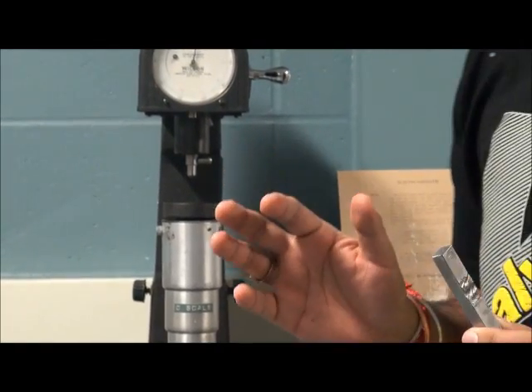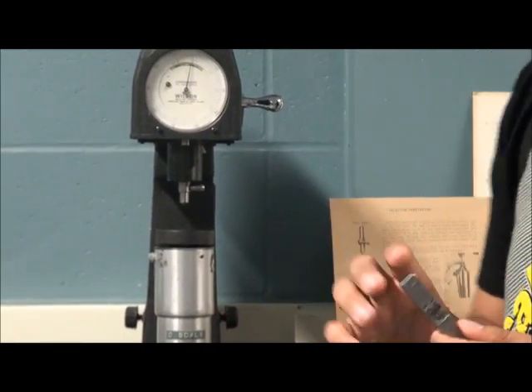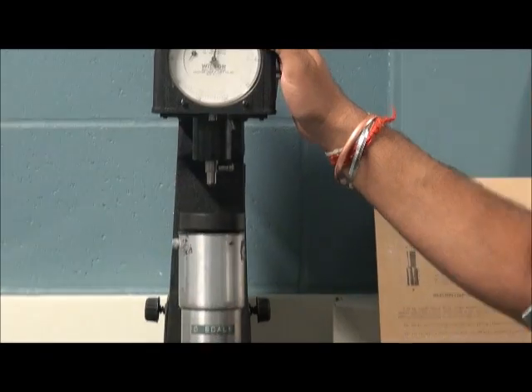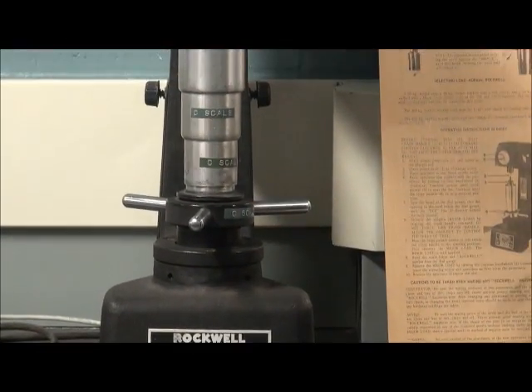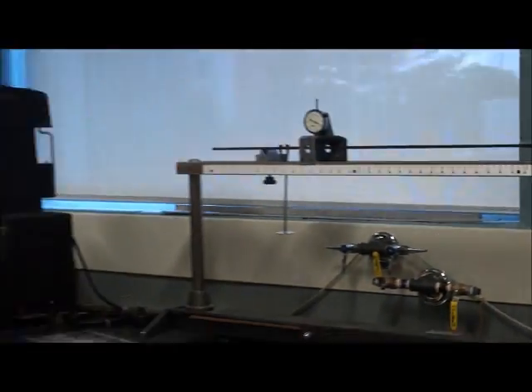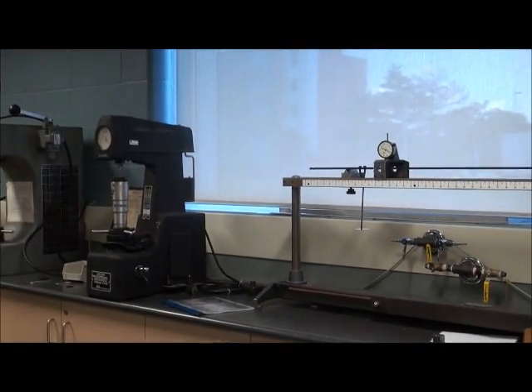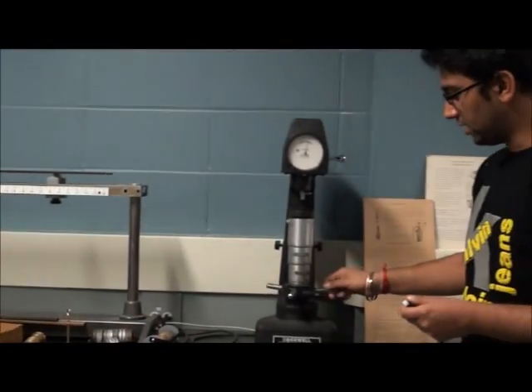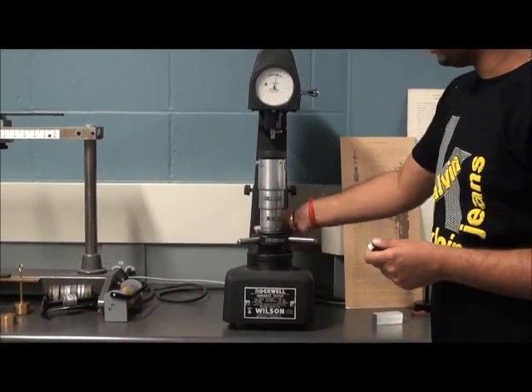To measure the hardness of this sample, we are using the Rockwell hardness scale. This is the B scale, and on this side we have a scale for the C scale. And this is the proper indenter.